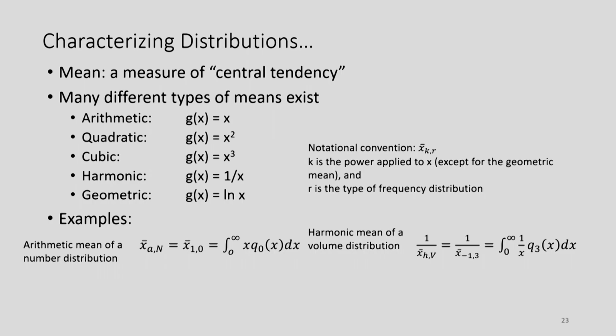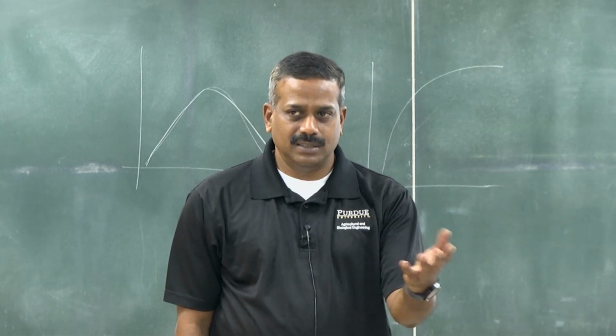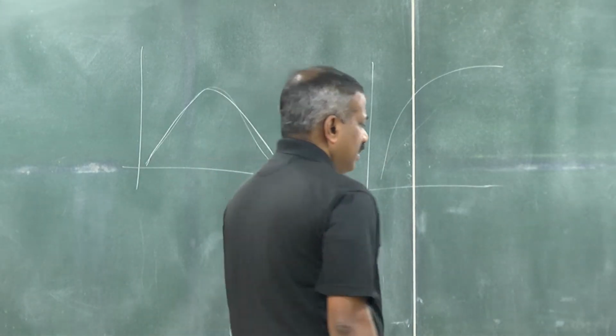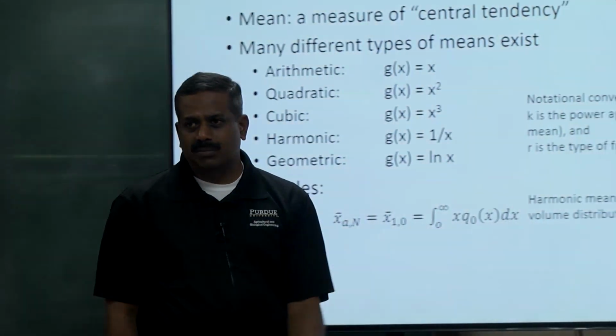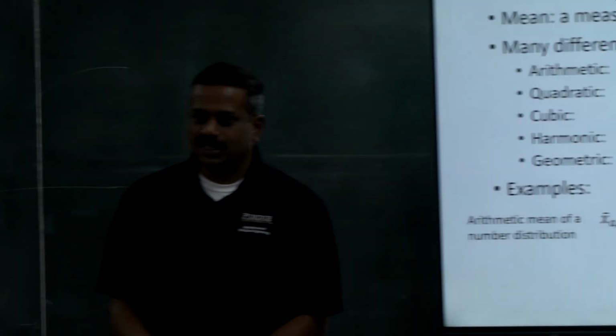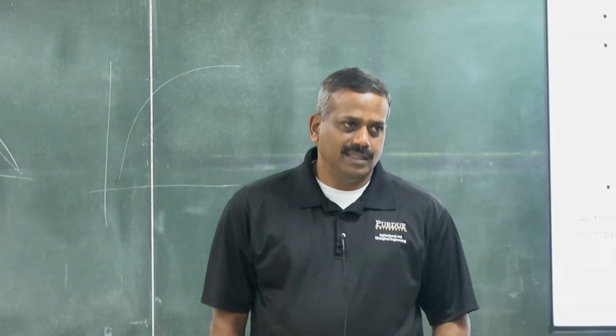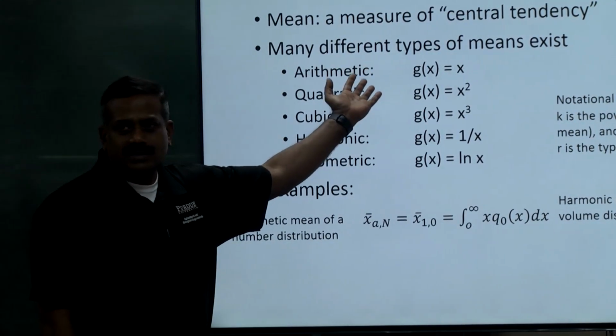If the distribution is uniform, the arithmetic mean will be okay, it gives a good average value. But if you have a wide distribution, for example positively or negatively skewed, like the space debris example I showed, you'll have to include different factors, such as the number of particles in each category. Then you might use a geometric mean so that you bring all the particles together if the distribution is much wider. If it's tighter, then the common choice is the arithmetic mean.